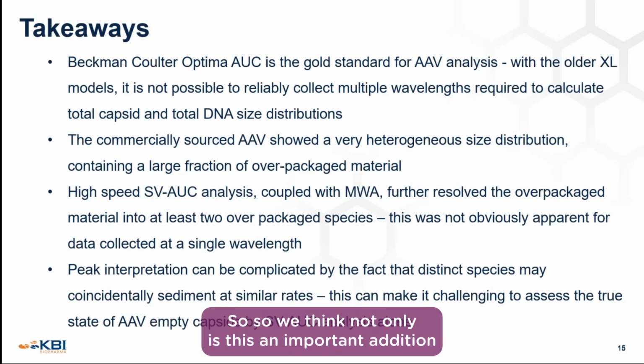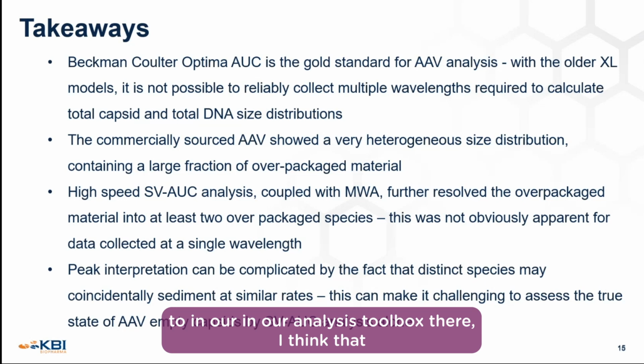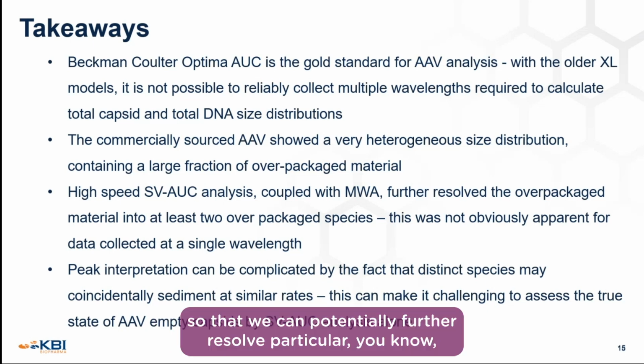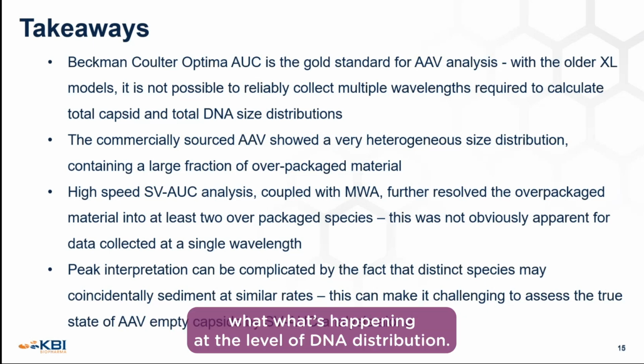So we think not only is this an important addition in our analysis toolbox there. We think that we want to be running these things over a range of wavelengths so that we can potentially further resolve in particular what's happening at the level of the whole DNA distribution.